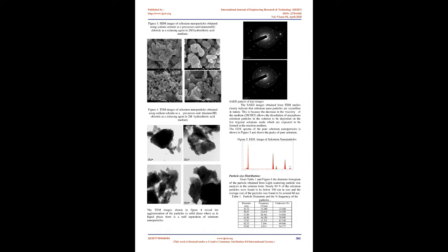All the peaks can be readily indexed to crystalline trigonal selenium (t-Se), JCPDS 6-362, as a comparison. Although the diffraction peaks from XRD patterns of the raw selenium powders can be well indexed to trigonal selenium with the P3121 space group, the strong diffraction intensity of the 101 peak is indicating the trigonal selenium, t-Se.